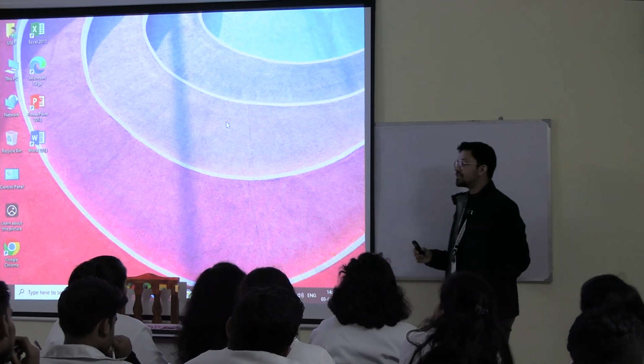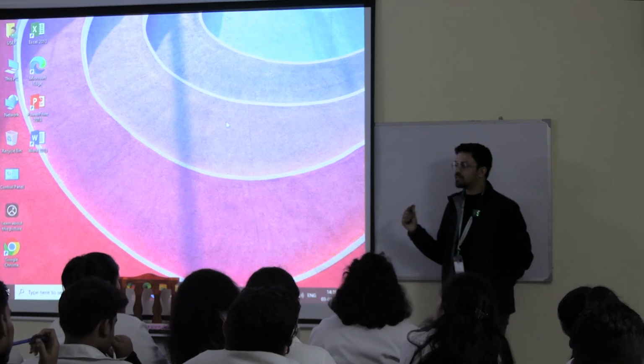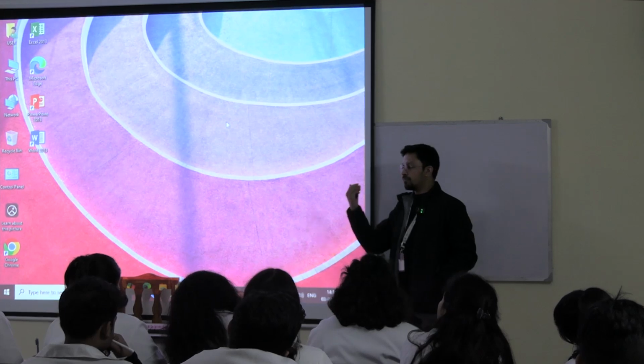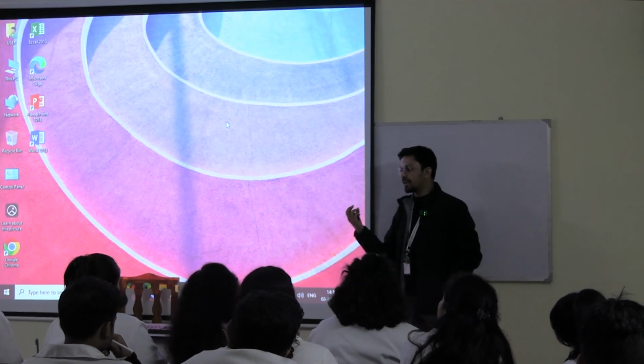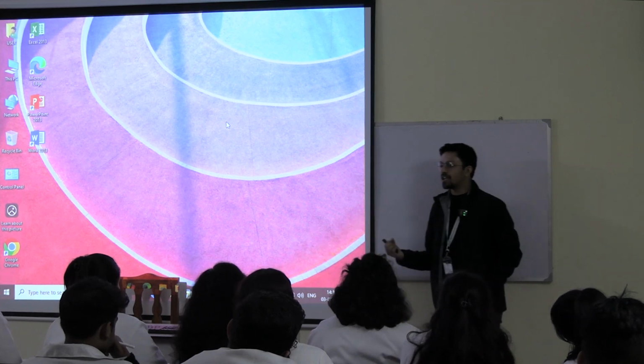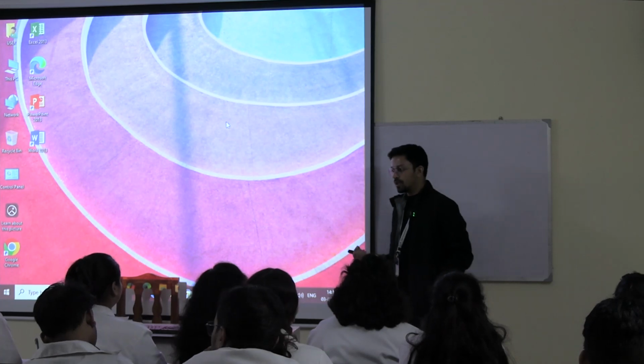When we are measuring the blood glucose, we are not exactly measuring the blood particles; we are measuring the plasma or the serum. We take the blood sample and centrifuge it. The RBCs and other particles present in the blood precipitate at the bottom, and only the clear plasma or serum remains as the supernatant. From the serum we take the sample and measure the blood glucose level.